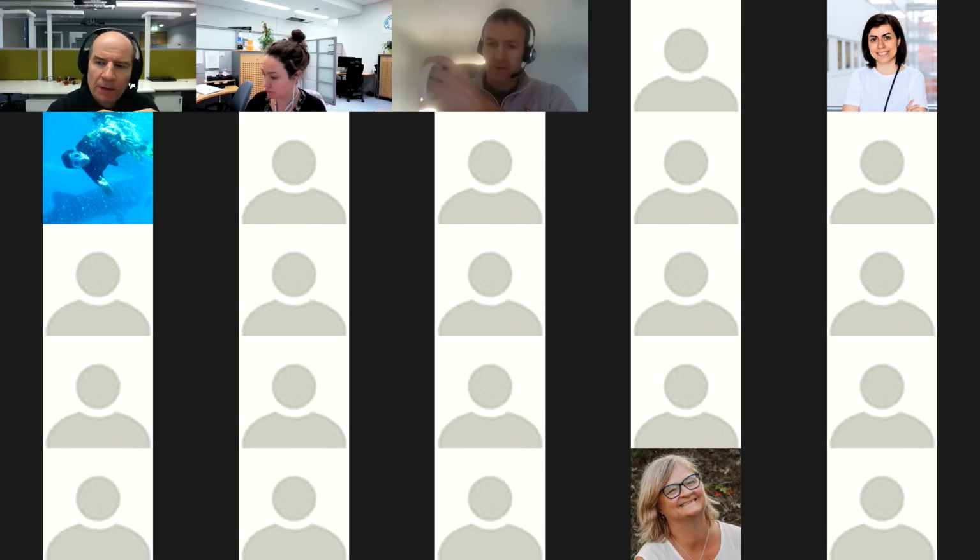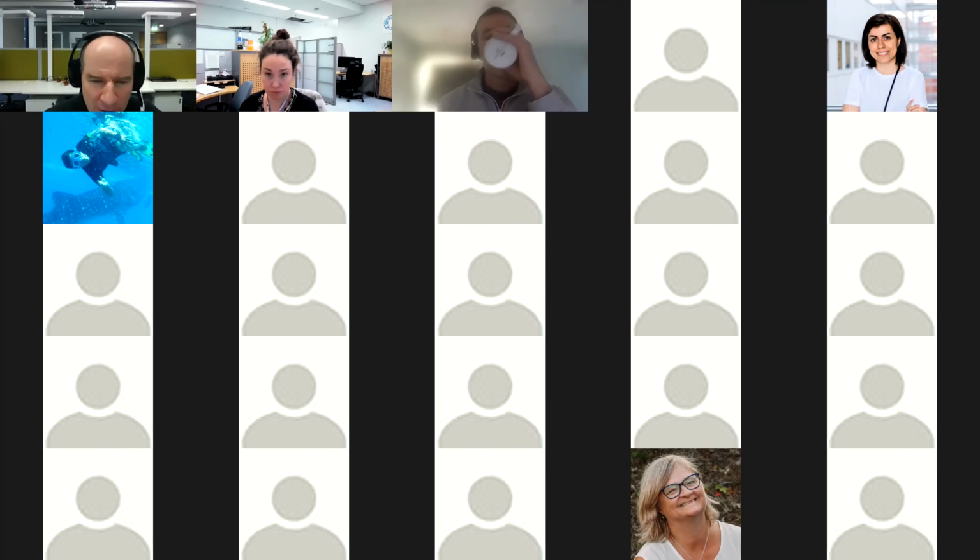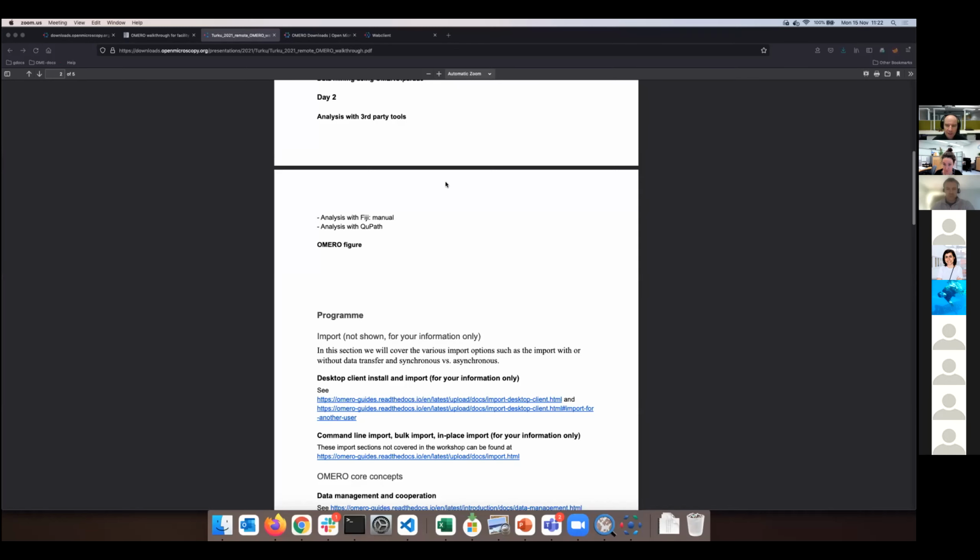Thanks. Well, now can we just get our head around the really convenient part? I'm going to show you how to work with Omero now, and you will be able to do stuff locally. This is the trick of Omero. All those things are remote, you still can work with them. So let's just go through that. Maybe we will understand each other better just after this part.